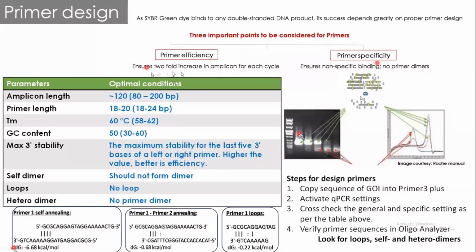Now, once you have designed the primer and conducted the real-time PCR, we need to be critical that every tenfold dilution should be 3.3 cycles apart. And if that is happening, you can plot a linear regression curve, which we will be doing in a couple of minutes, and then calculate the slope value, right? Based on the slope value, your efficiency can be calculated.